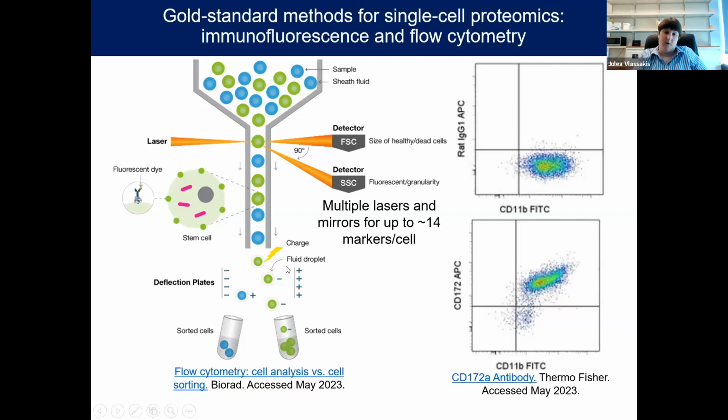So, of course, another capability that comes with flow cytometry can be fluorescence activated cell sorting, where cells with particular markers, in this case having your fluorescence signal or not having your fluorescence signal, are physically separated and sorted and collected. So that's a capability that comes with some flow cytometers.